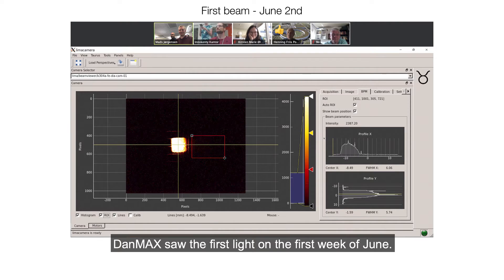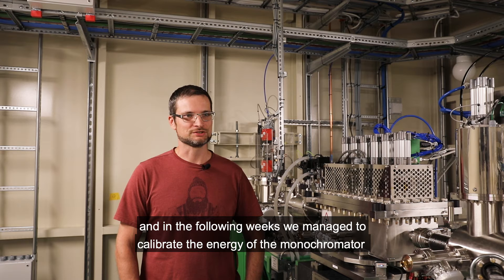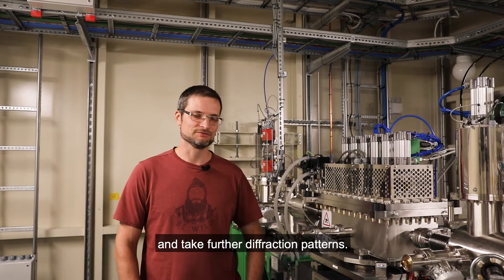DanMAX saw the first light in the first week of June. The week after, we could see the first monochromatic beam. And in the following weeks, we managed to calibrate the energy of the monochromator, get the useful beam in the end station, and take the first diffraction pattern.